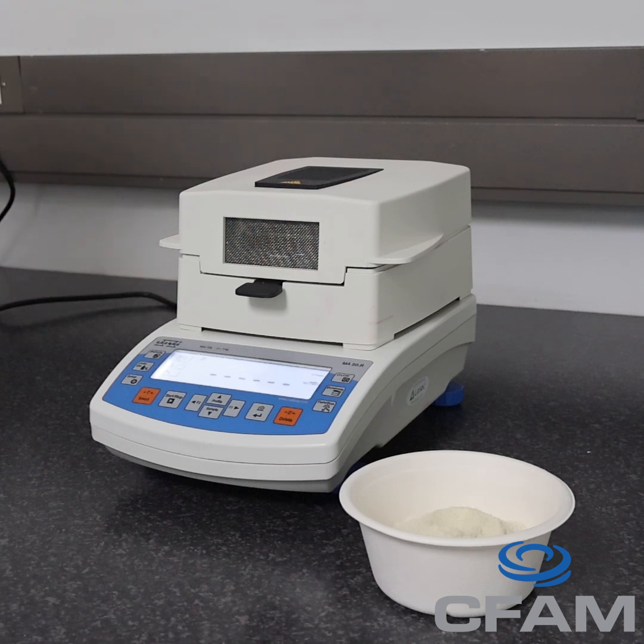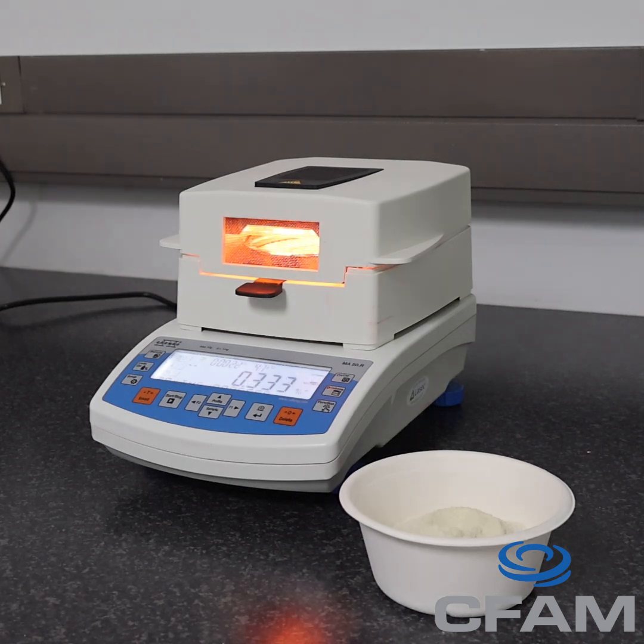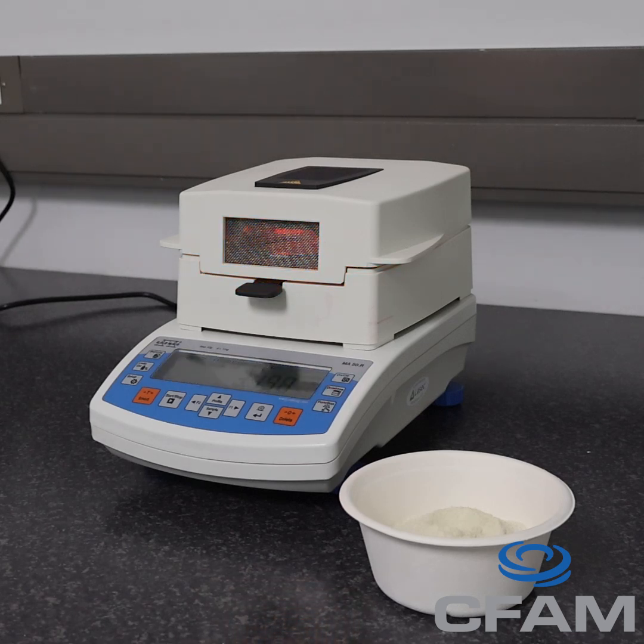The machine gently heats the sample and records how much weight is lost. That weight loss directly reflects the amount of moisture in the sample. Because this method is both quick and precise, it gives us accurate data we can rely on. This ensures consistent product quality and helps us make the right adjustments during production and development.